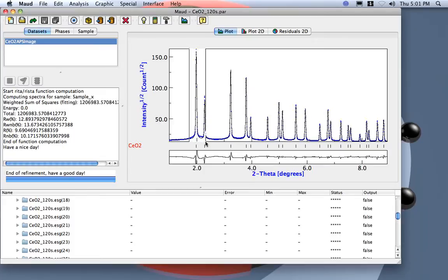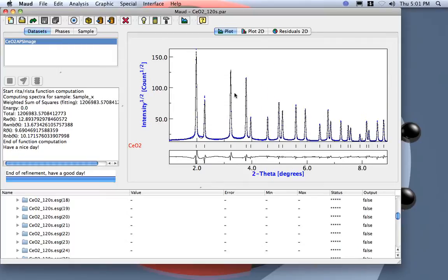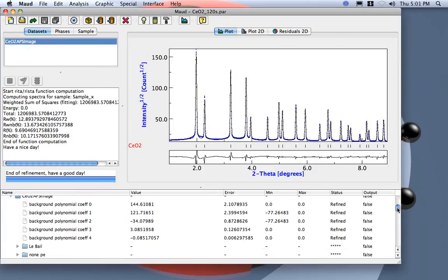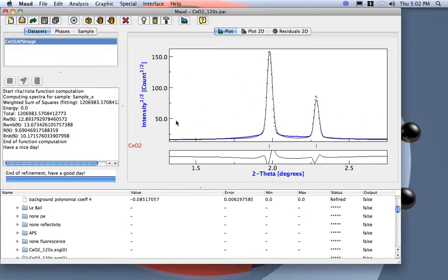Now let's check — it's going the other direction. So you can specify the direction of the asymmetry using the sign on the truncation angle. Now I've already specified that I want to refine the asymmetry. The other thing is I want to get here a second phase — a second cerium oxide phase — to account for the broadening of the tail.